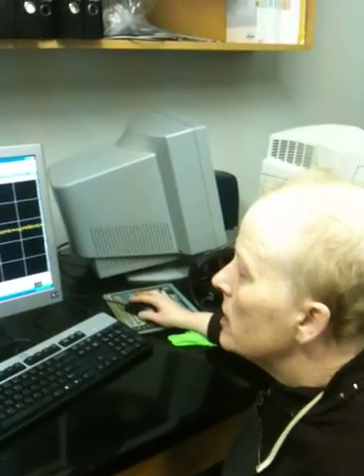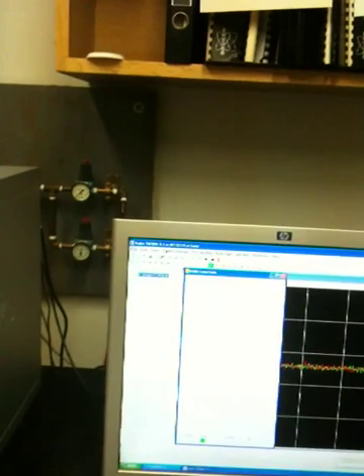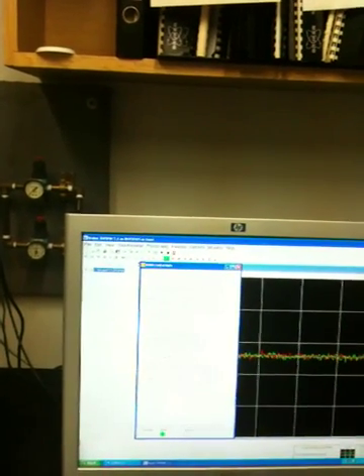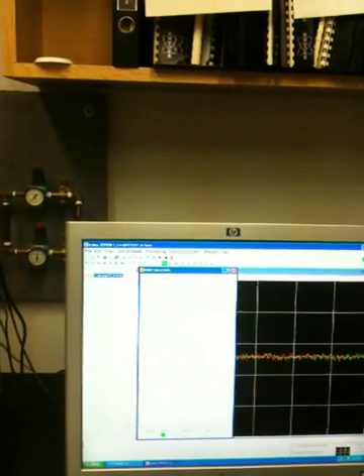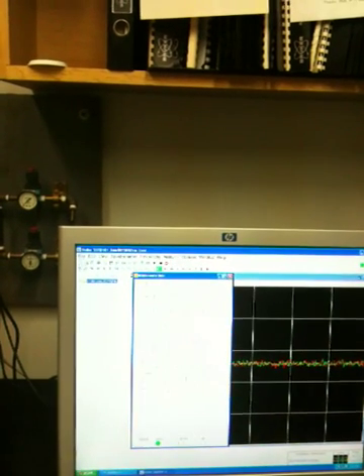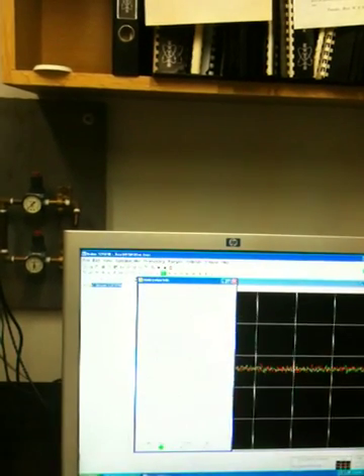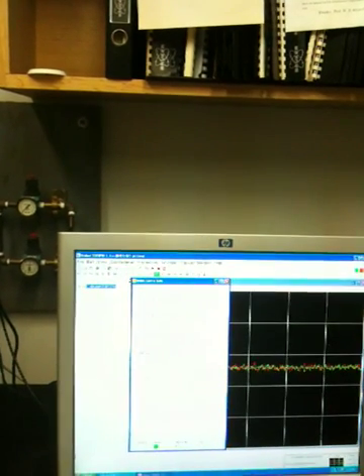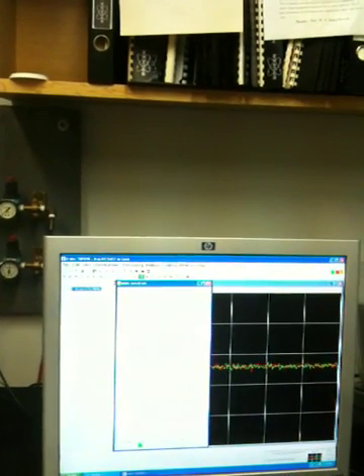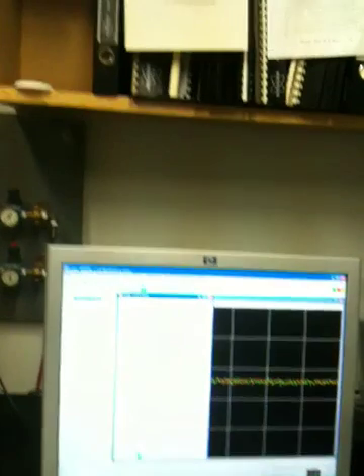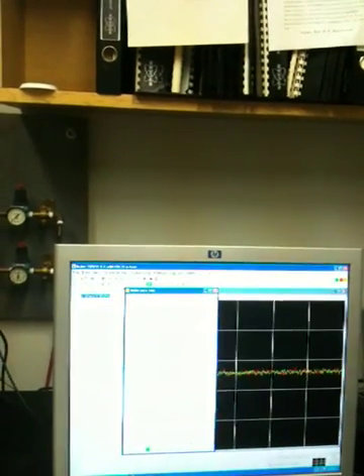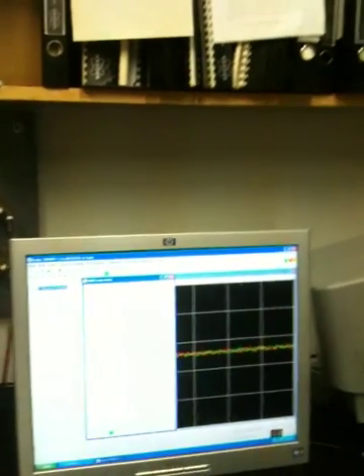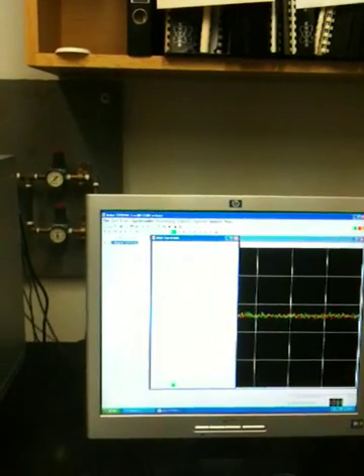Shimming a magnetic field is adding and subtracting to the main magnetic field to make the magnetic field more even, like you're leveling the field. So these are the shims. You'll notice they are controls that are based on an XYZ axis system. This axis system is around the main magnet, or around the sample. So, what I'm going to do is a little bit of shimming.